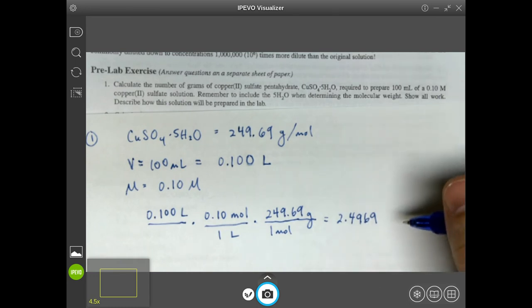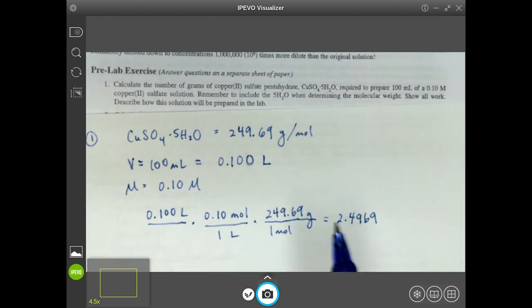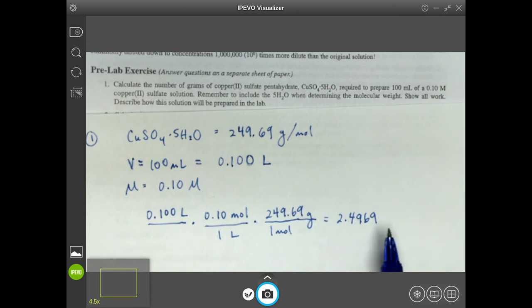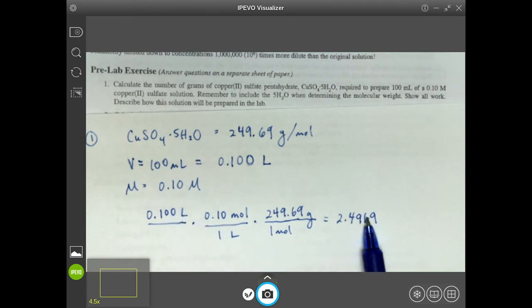So now again, everybody's always like significant figures. Well, technically this only has 2, but this is kind of an in-between thing where we're trying to get something that is accurate to at least 2. So if we take it further, that's okay. I'll tell you that the scale I'm going to have you guys use is that digital scale, the one that will measure as accurately as the other ones.